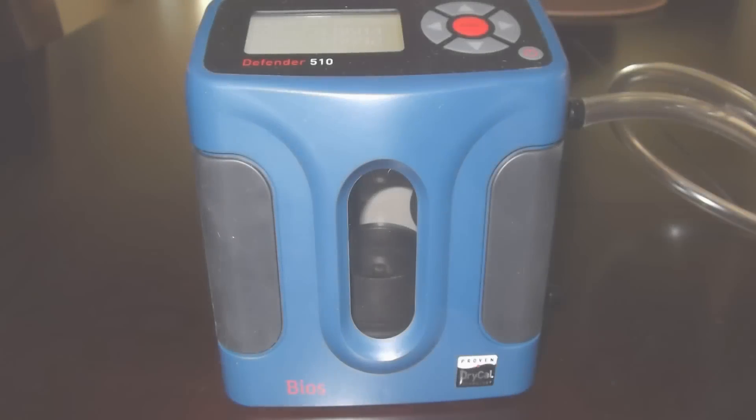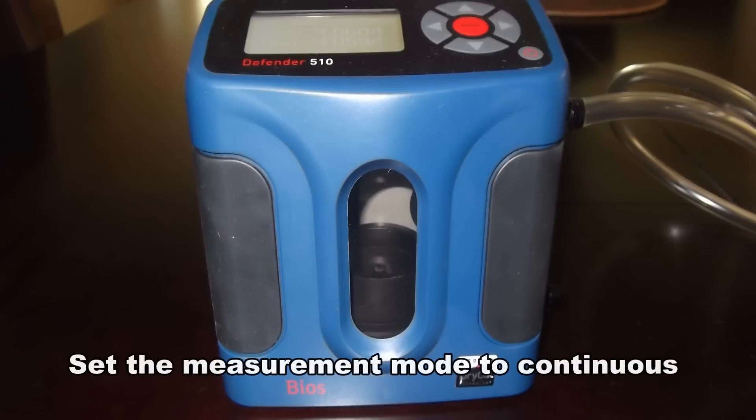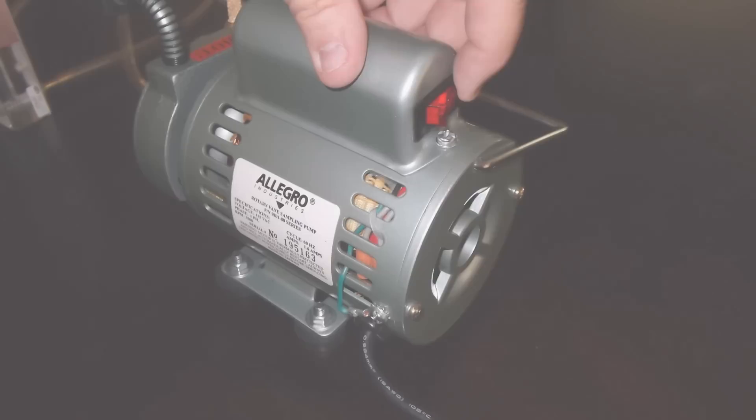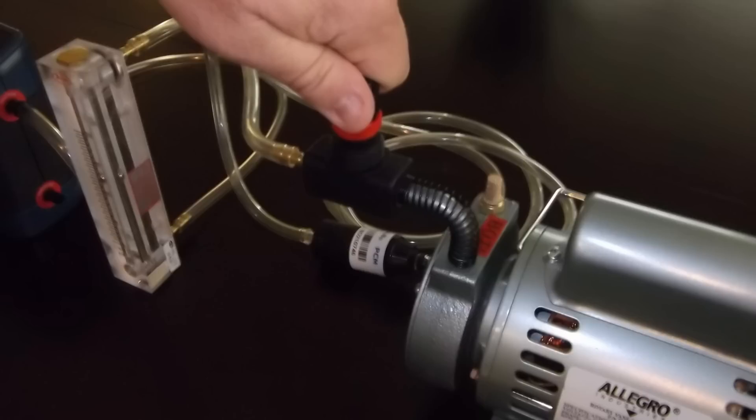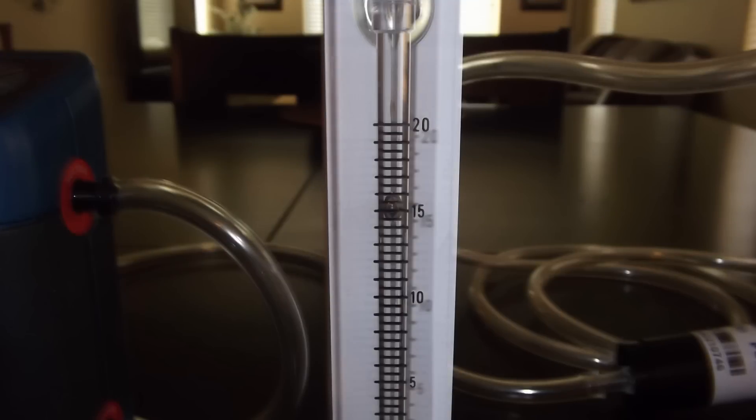Turn on the BIOS Defender, setting the measurement mode to continuous. Now turn on the high volume pump and adjust the flow valve counterclockwise to the desired flow rate indicated on the primary calibrator. Once the desired flow rate of the method being utilized is achieved, verify the flow rate on the rotometer for accuracy and calibration of the rotometer.